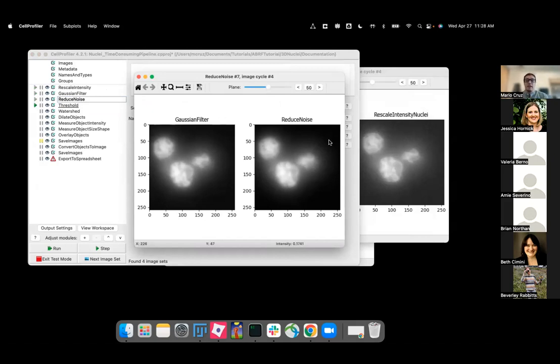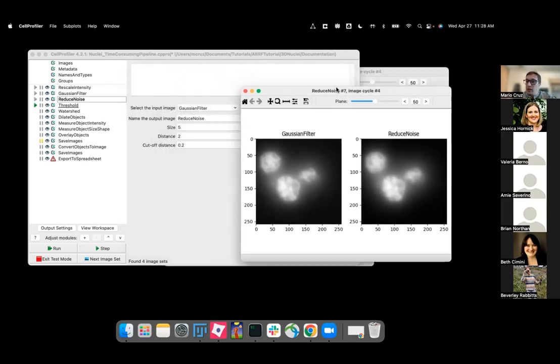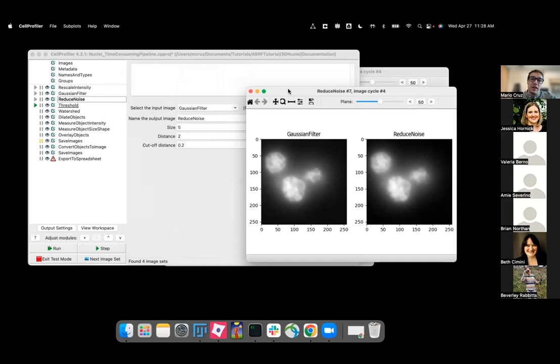So when you have this normalized, you can just apply a threshold or a watershed or an algorithm to segment your objects. Because we normalized all images, we can use one pipeline to segment all the images they provide in this study.